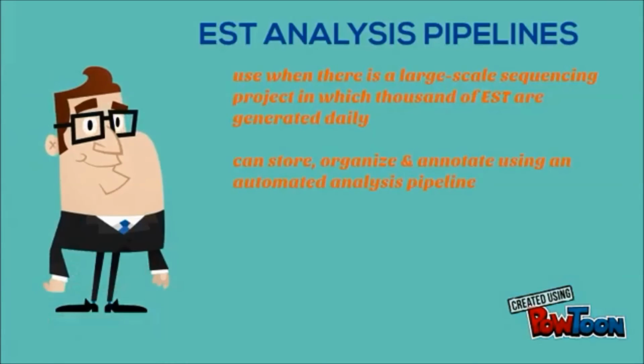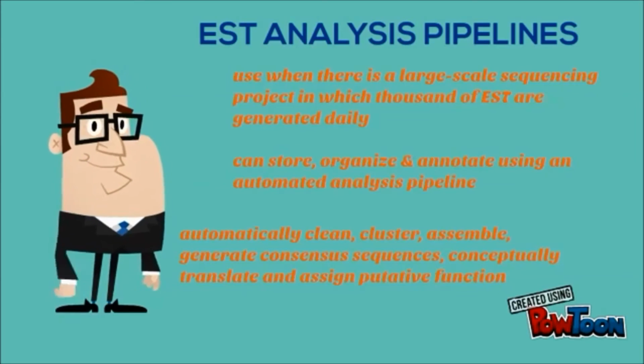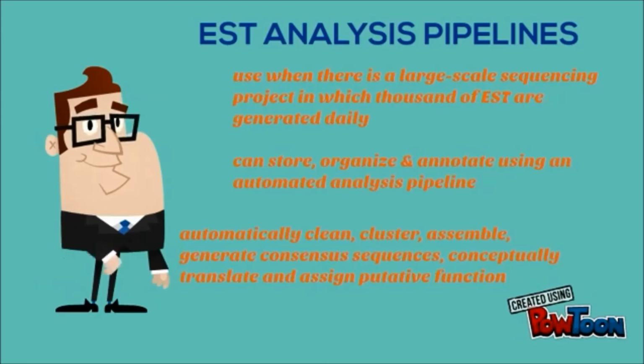It is used when there is a large-scale sequencing project in which thousands of ESTs are generated daily. They can be stored, organized and annotated using an automated analysis pipeline. The pipeline automatically cleans, clusters, assembles, generates consensus sequences, conceptually translates and assigns putative function.